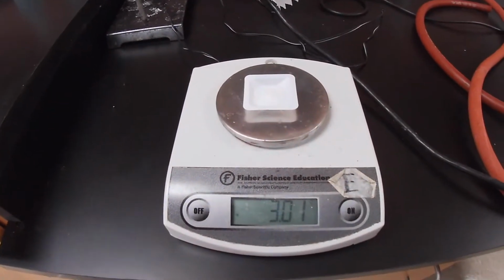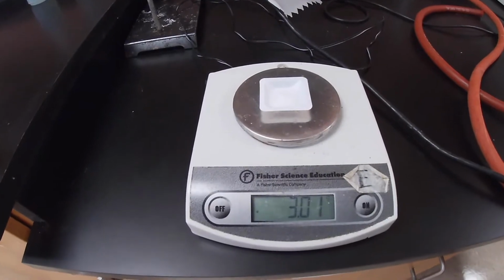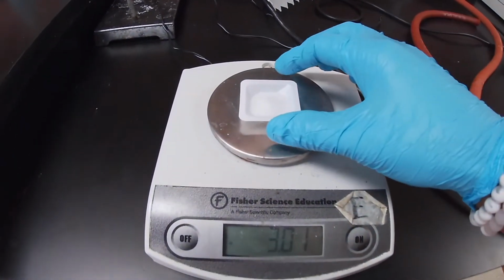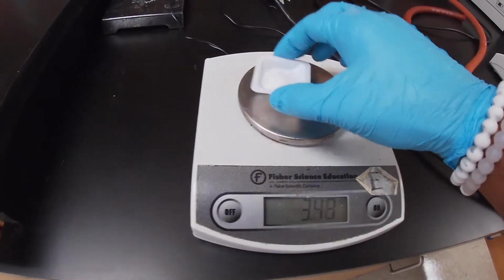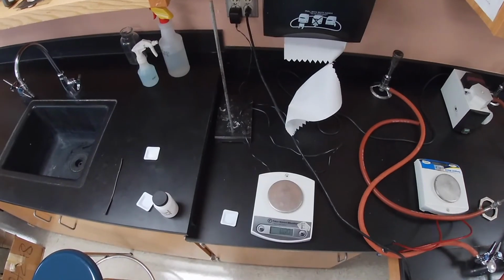And so remember this substance, we're gonna go ahead and transfer it to our test tube. And then we're gonna go ahead and heat. So I'm gonna go ahead and get the other 2 masses as well, okay? So we're gonna remove this one, and then we'll start on the next.